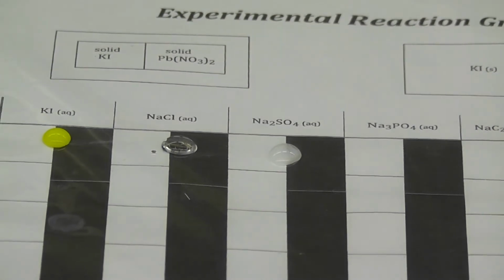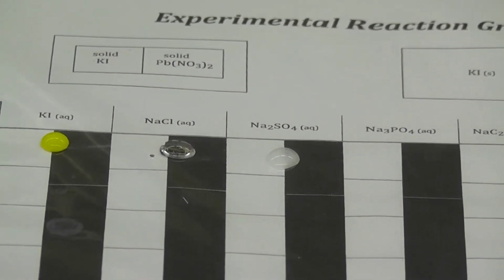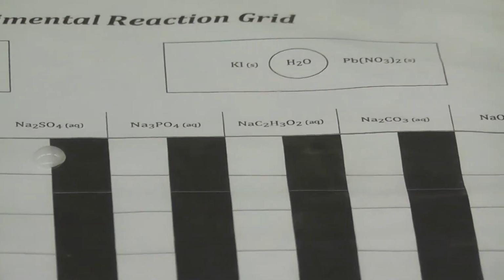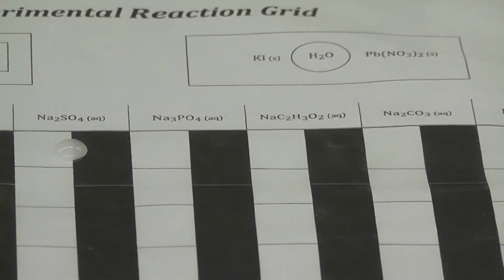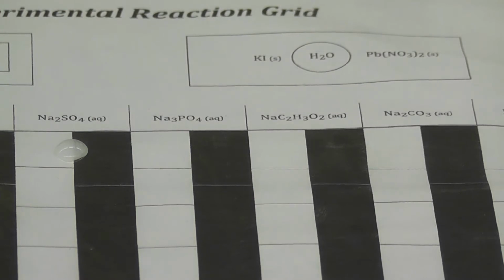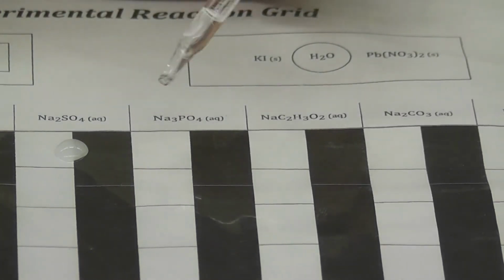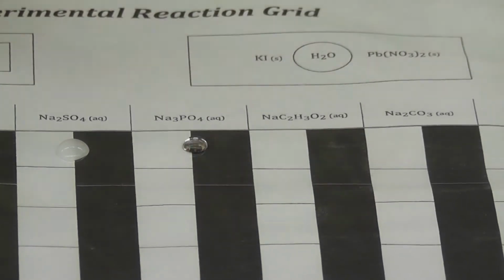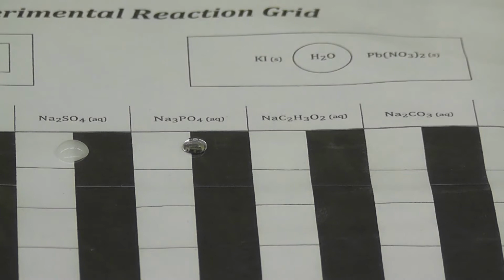Okay, record your observations for that reaction of lead-2 nitrate and sodium sulfate. Okay. Once again, we're going to be using the lead-2 nitrate with, this time, the sodium phosphate. So drop that right in the middle between the two. Best to get it in between.